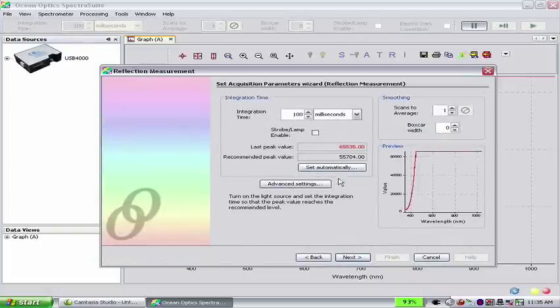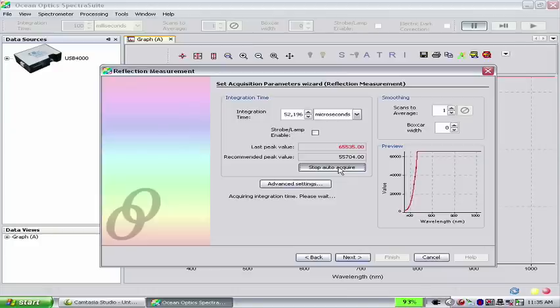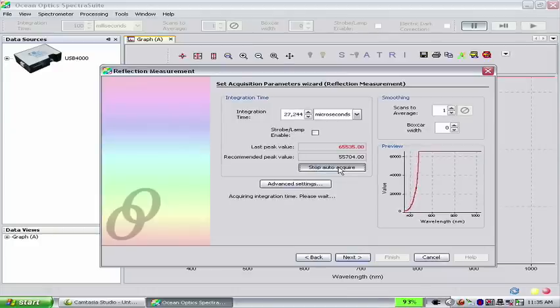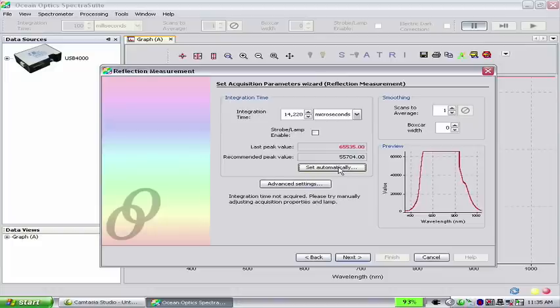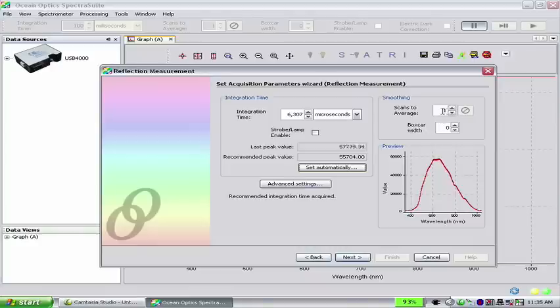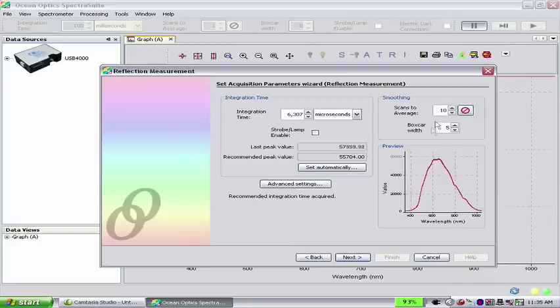Click on the Set Automatically button. This allows SpectraSuite to find the ideal integration time for the reflection measurement. The integration time is correct when both the last peak value and the recommended peak values are both black text. You may have to click on the button more than once. Let's also set 10 scans to average and a boxcar width of 5. This will increase the signal-to-noise ratio and smooth the spectrum. Once you have set these parameters, click Next.